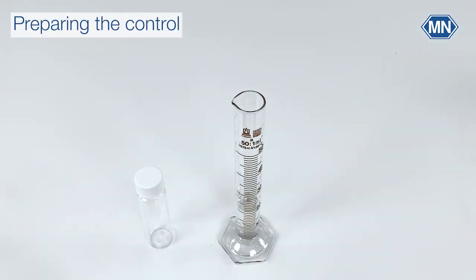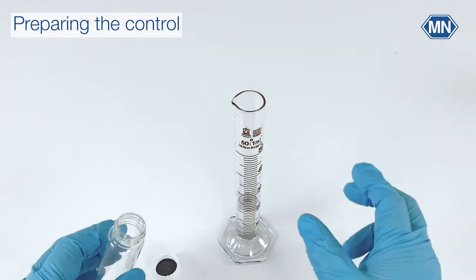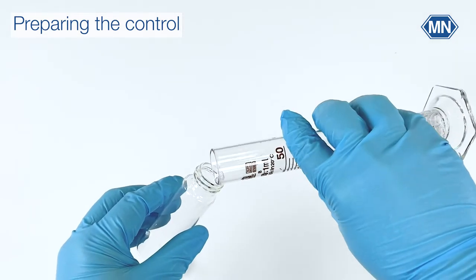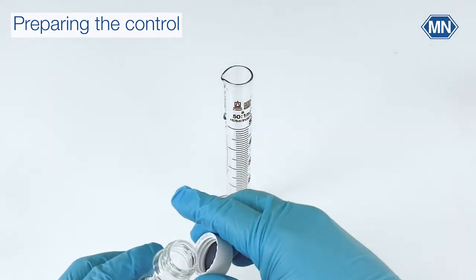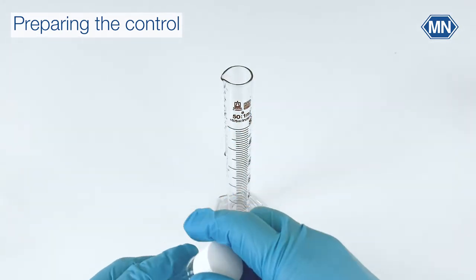In the first step you have to prepare your blank. Measure 20 ml of your diluting water and fill it in a reaction vessel. Shake it strongly for 30 seconds to enrich it with oxygen.